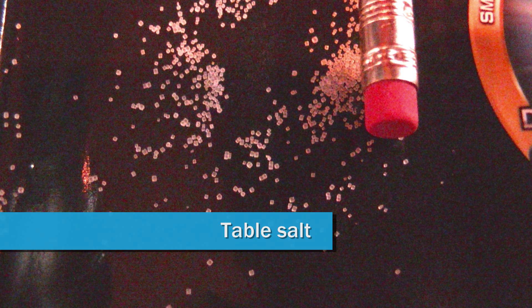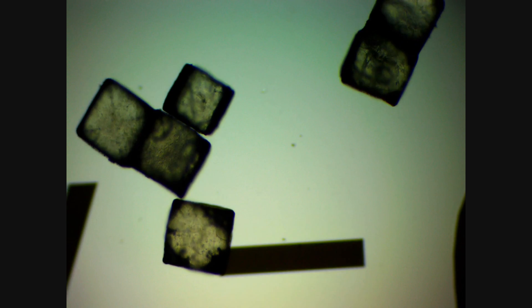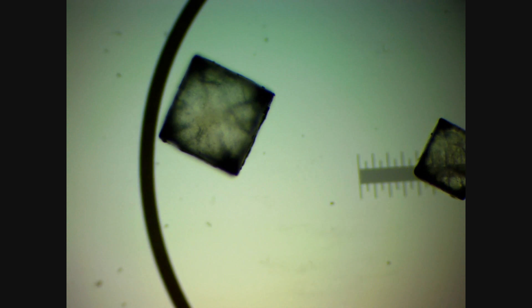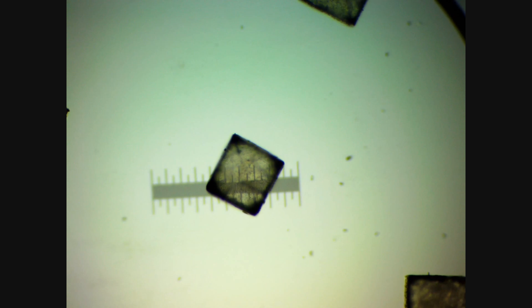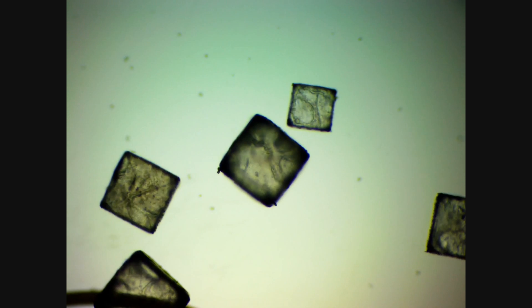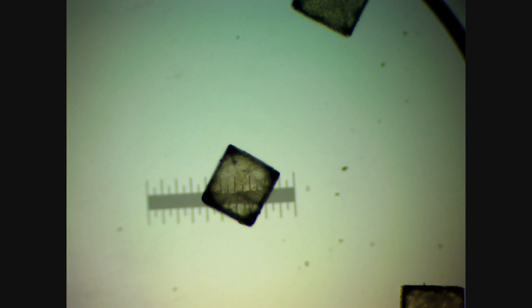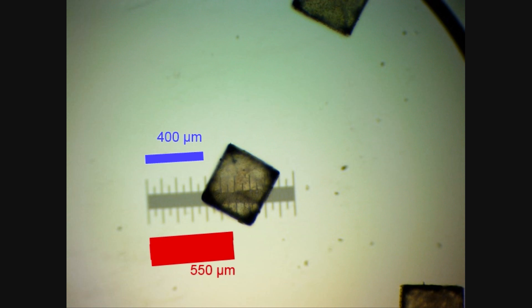Next up is table salt. These table salt crystals are much more uniform. They're nice and square. They don't have as much variance as the sugar crystals did. They're almost all around the same size, with a few exceptions. These crystals tend to range from about 400 to 550 micrometers.